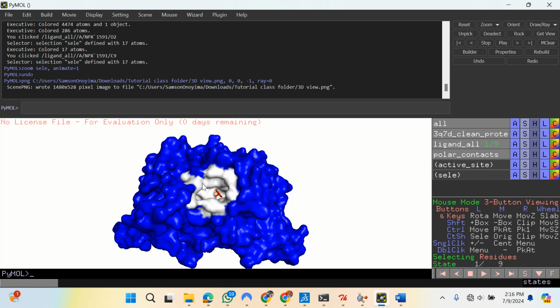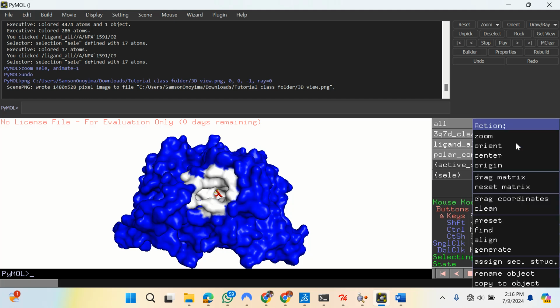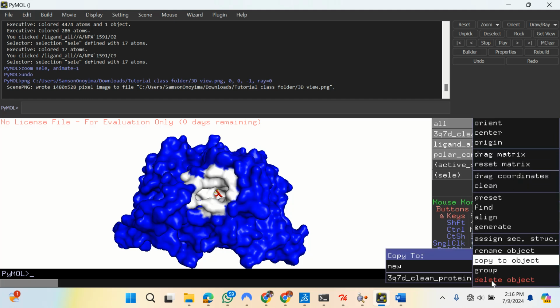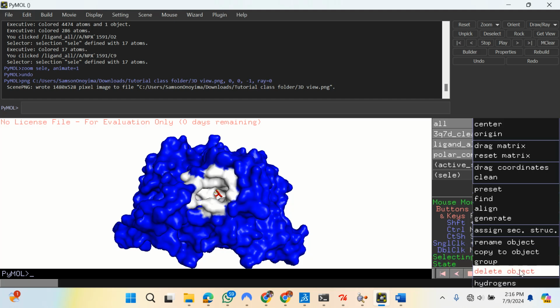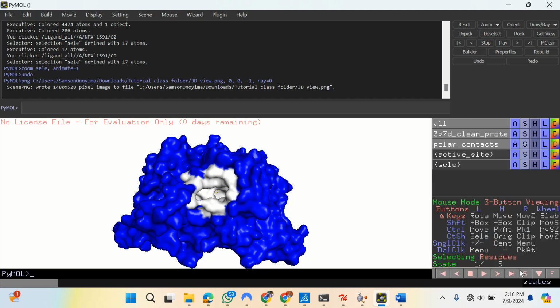So what you'll be loading here is simply your ligand, not your protein. So this is what you put in your work. This protein will remain here. What you'll be deleting here is the ligand. You can delete the ligand here. I can now move down because I have notes here. This system is a mini one, so it compresses. So I can delete the object here, and if I delete it, this object will go away.